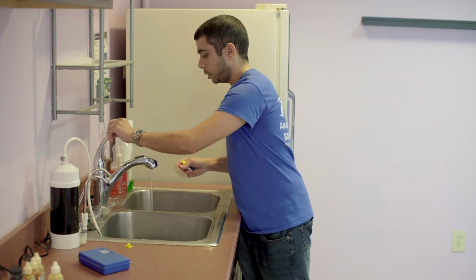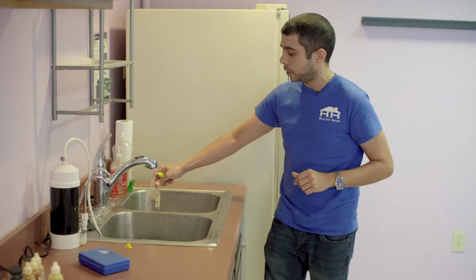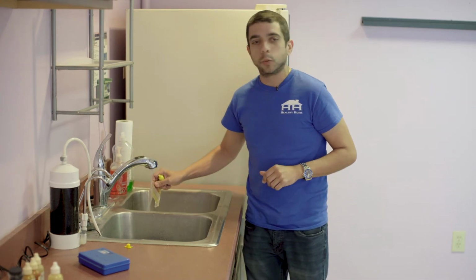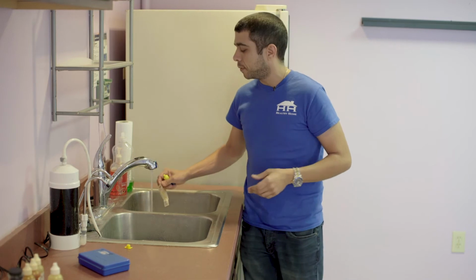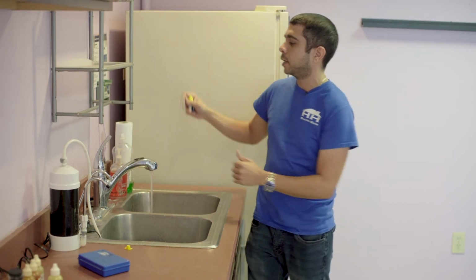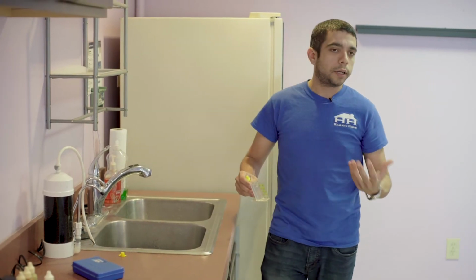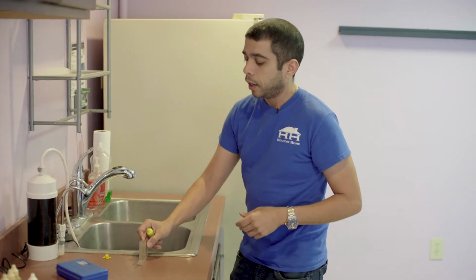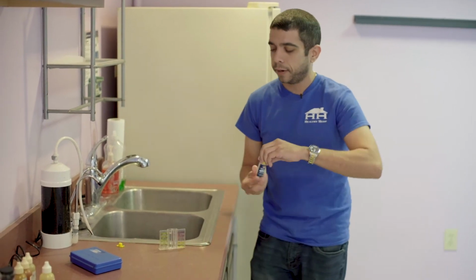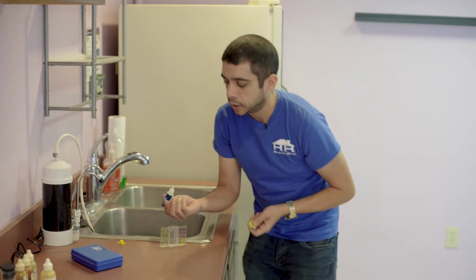When I would jump in the pool as a child, my grandparents and my mother would always tell me, when I got out of the pool, to go and do what? To rinse off. Pools have excessive amounts of chlorination. Some people react a little more negatively than others. Sensitive skin, allergies, these things happen. Anyhow, what we're going to do now is add our 5 drops of OTO and see where this takes us.